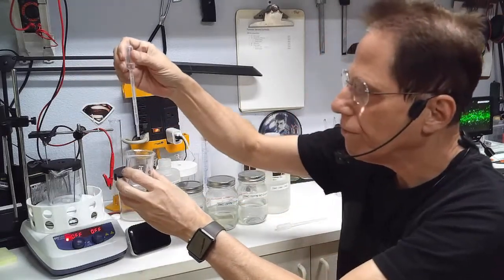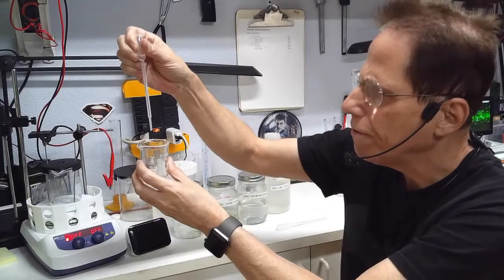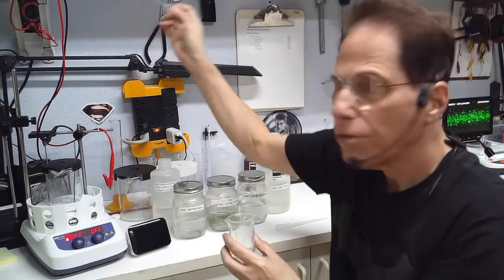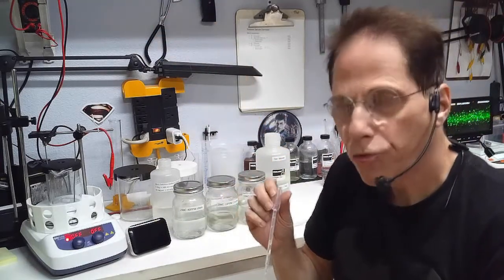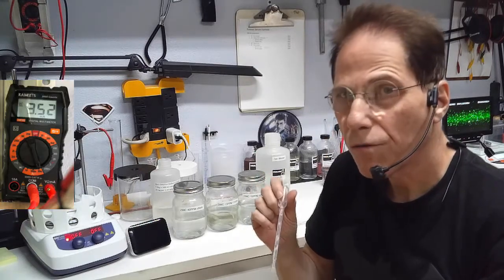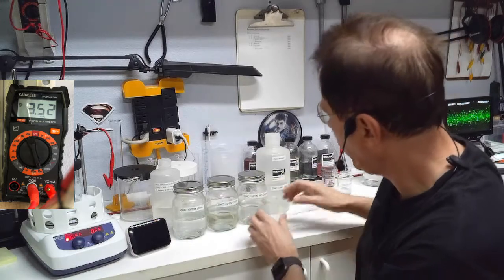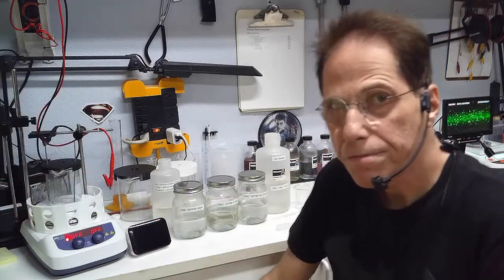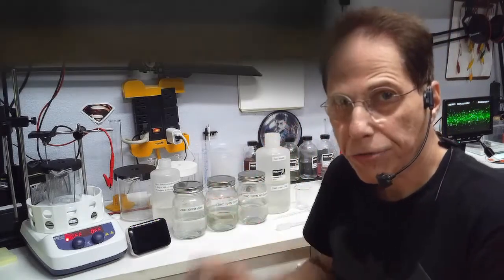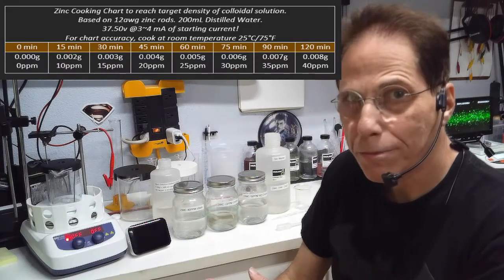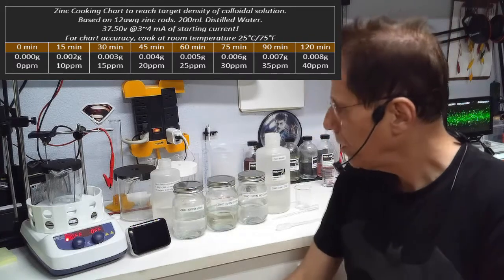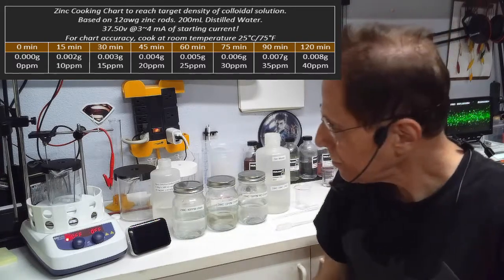You're going to drip in one drop at a time. You can use an eyedropper or a pipette. You're going to drip one drop at a time and watch the meter until it reads three milliamps. Don't let it go over five milliamps. Ideally you want to keep it between three and four milliamps of current. Then the chart will be accurate. The further you go away from three milliamps, the faster it's going to cook and the less accurate the chart's going to be.